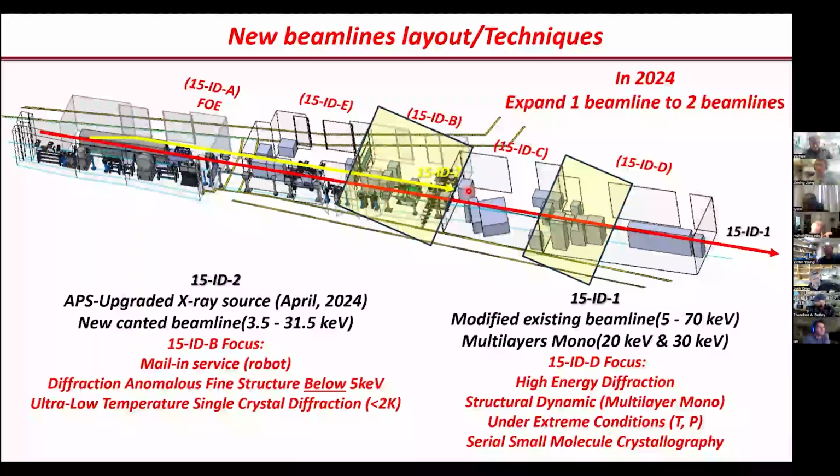And what's the opening angle in the diamond anvil cell? So we have a 120 and an 85. But the 120 one probably cannot hold high pressure. The 85 probably, if you go to gas loading, you can go higher. But normally we don't want to compare with our brother beamline, GSECARS, which goes to very high pressure. We just normally go below 10 gigapascals, because I think chemistry wants a good structure.